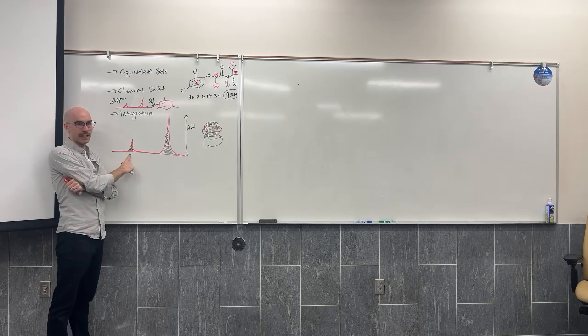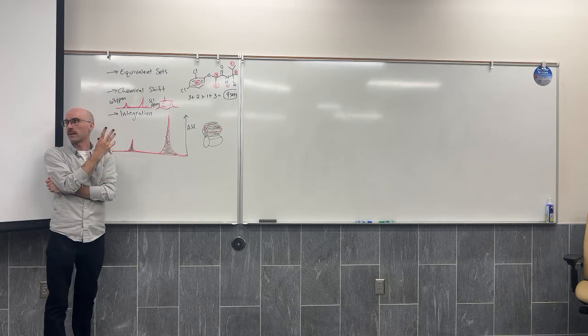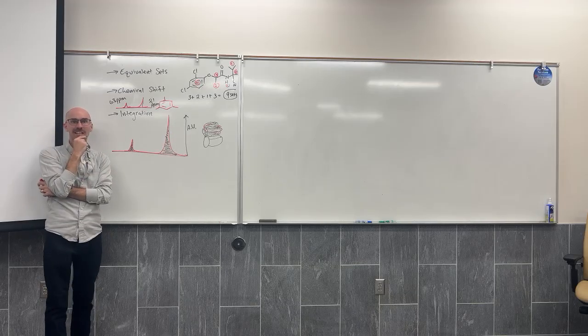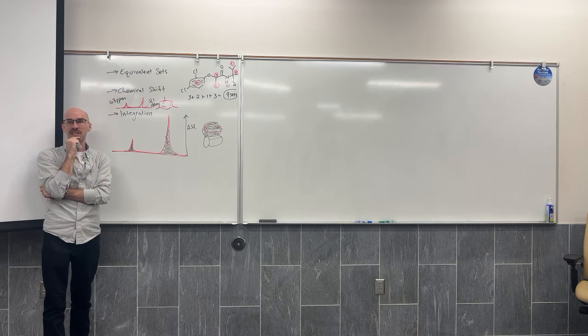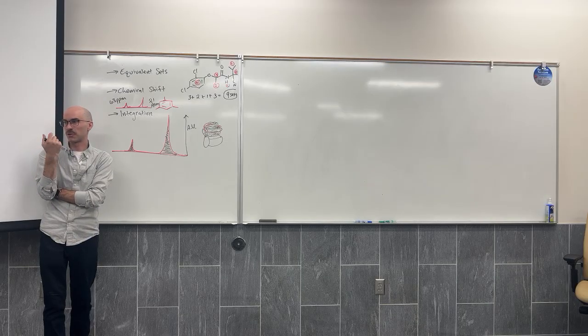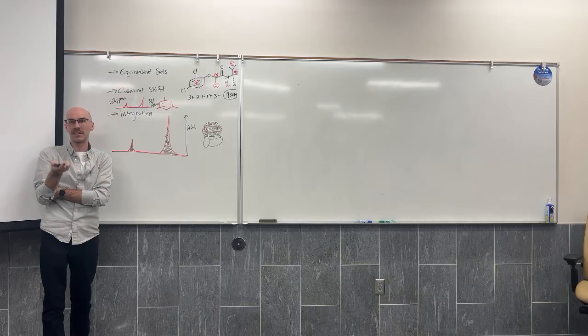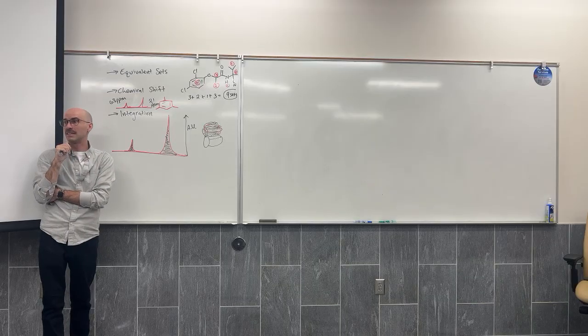So when I take the area, which is length times height or whatever, I have an arbitrary unit, so my instrument doesn't really know what number I'm looking for. Is it really just going to pick an arbitrary number from an arbitrary unit and give me an arbitrary area?